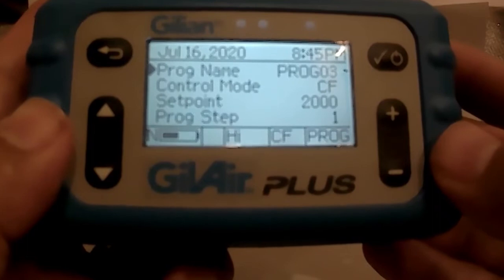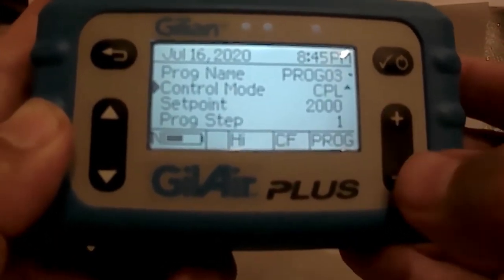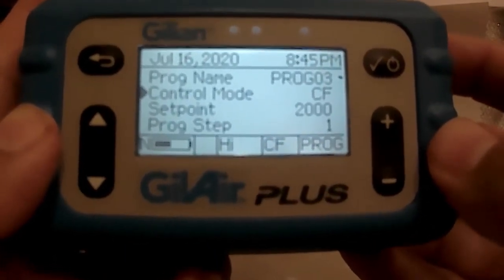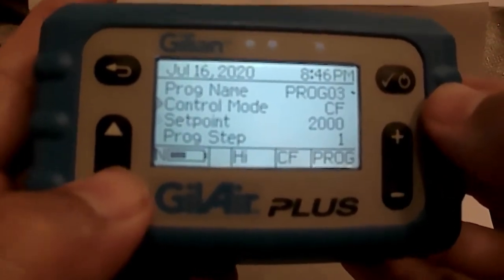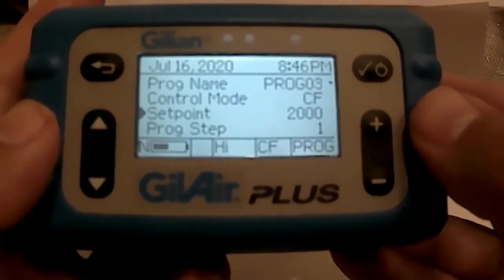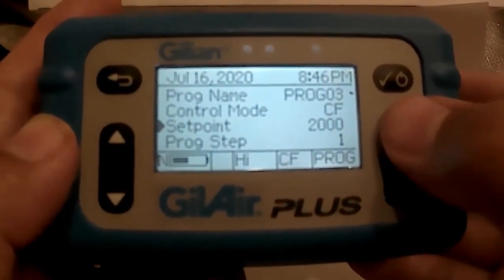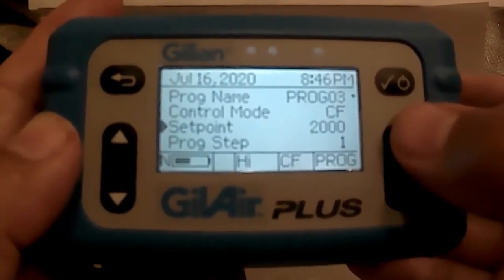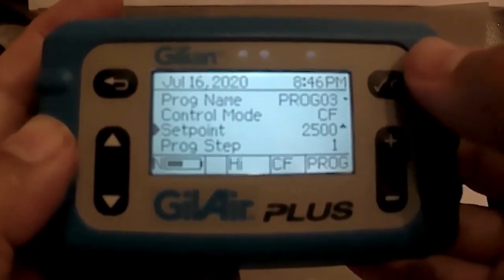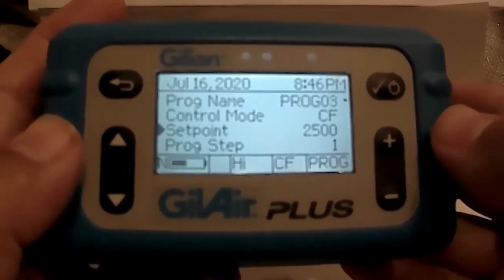My first step is to establish which control mode I want the pump to operate in. I will arrow down to control mode and use the plus or minus key to set it. For today's purposes we'll leave it in constant flow mode and hit enter, then arrow down to the set point. The set point is your flow rate for your sampling event — right now it's set at 2000 cc's. We're going to change that to 2500 cc's, holding the plus key until the value reads 2500, then hit enter to save that set point at 2500 or 2.5 liters per minute.